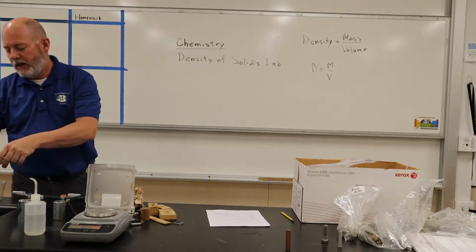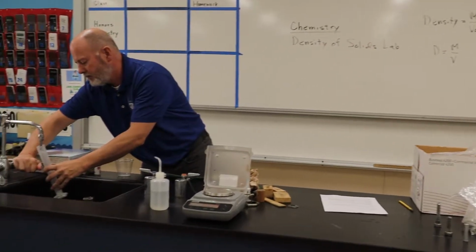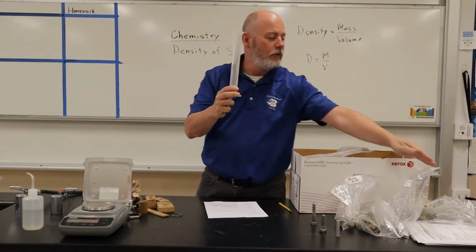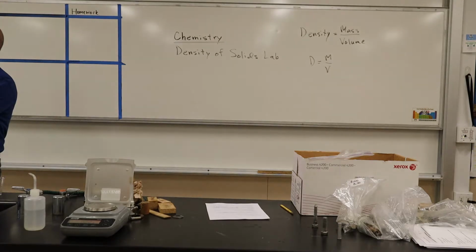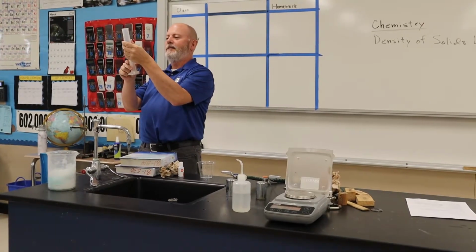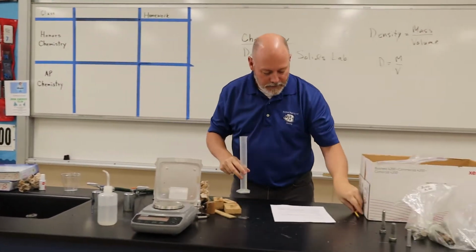All right, and then last but not least, we'll do the copper piece here. You know what I could do? Hold it behind a black, dark backdrop. So that's 55. Well, that's 60, so that's 10. 56. All right, so that's 56.